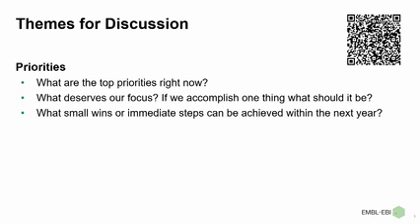So we're in the moment also creating a survey to send around and share with people in different communities to learn about how they would report chromatography conditions, for example. And that's going to also feed into these activities then afterwards. The second part of the question was? Retention time standards.